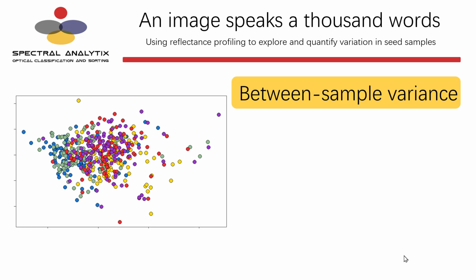And then we can look at a scenario in which we wish to examine 100 hemp seeds from all 5 samples. In other words, 500 dots, as shown here in this similarity plot. The similarity plot shows that most seeds, irrespectively of sample ID, are grouped together and therefore similar, but each sample also has a few outliers.